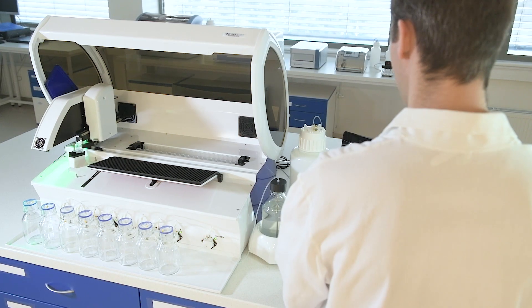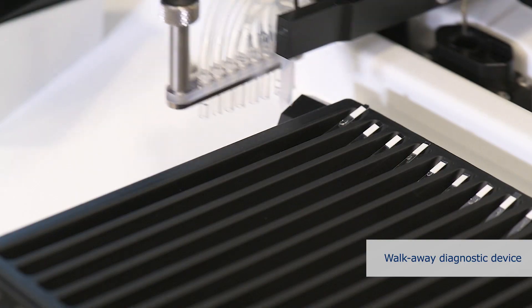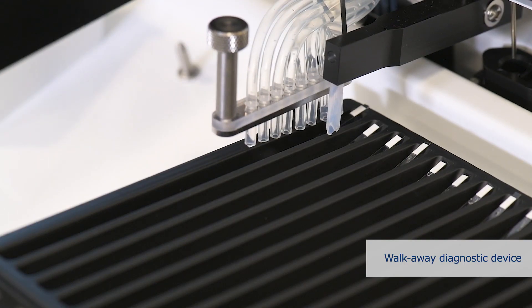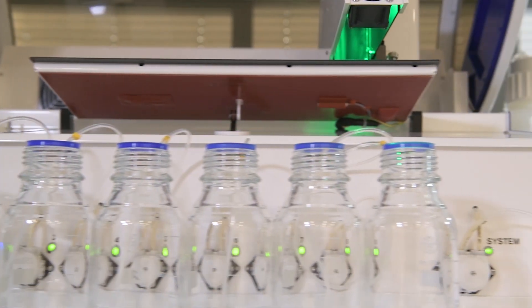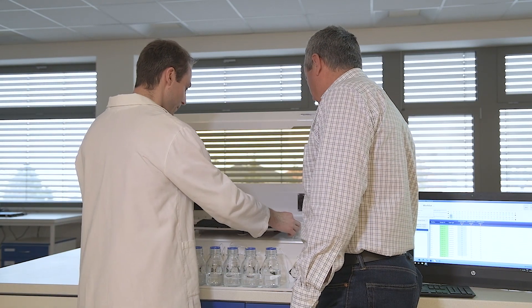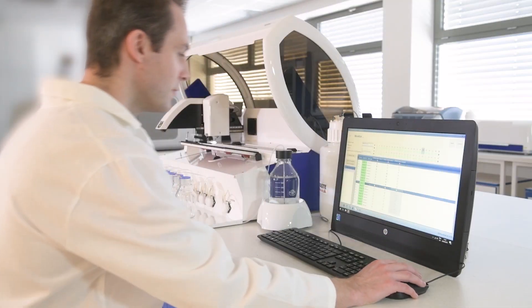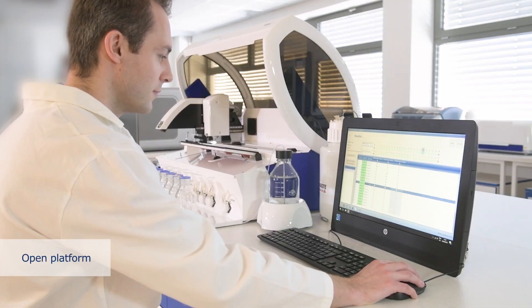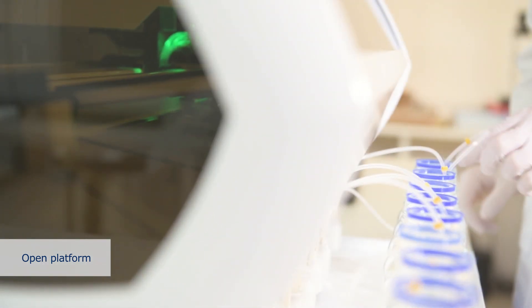It combines the fundamental qualities of a walk-away diagnostic device with uncompromising flexibility and convenience. This smart product couldn't be invented without the application experience and collaboration with assay kit manufacturers and opinion leaders. It delivers a wide range of programming possibilities for almost any assay kit in the world, but in a design that's practical and user-friendly.